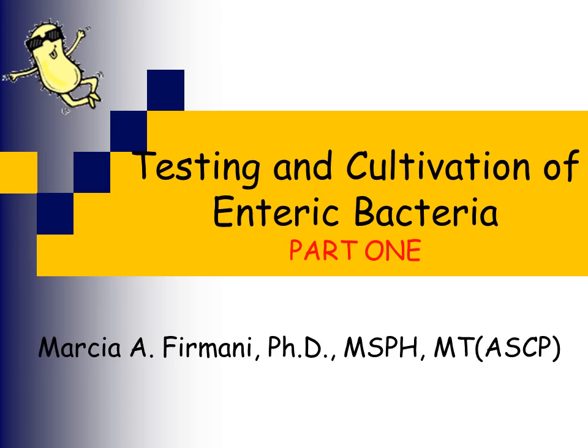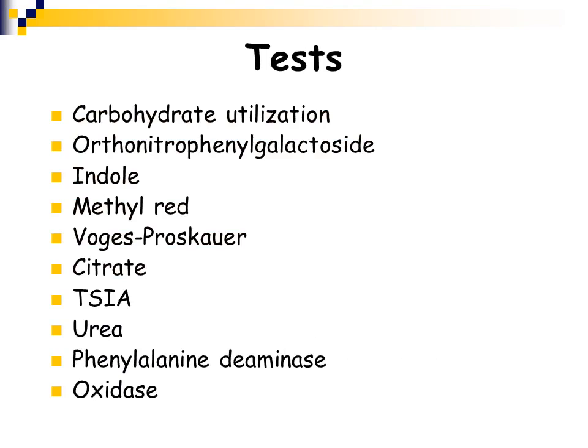In this lecture, we are going to discuss the testing and ways to cultivate and isolate the enteric bacteria, or the coliforms, and these are our intestinal bacteria. This lecture has been separated into two parts, and this is part 1.